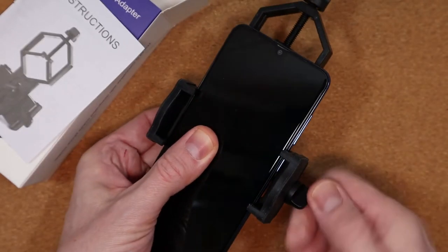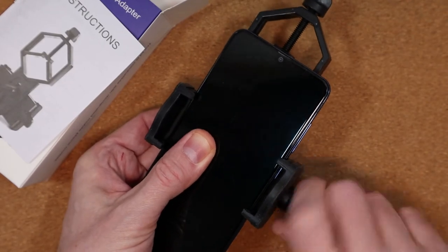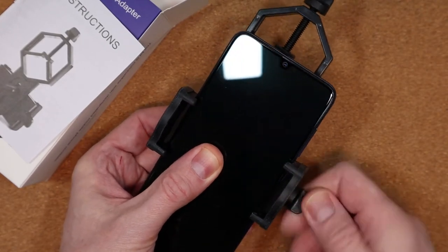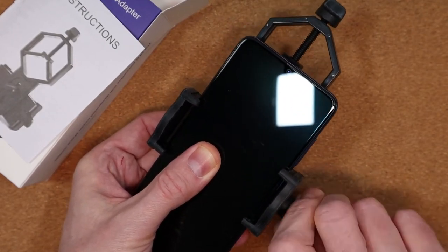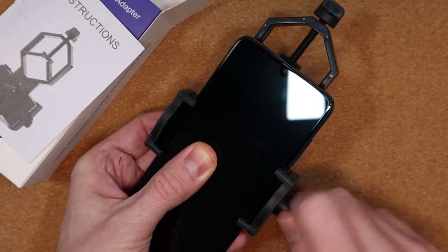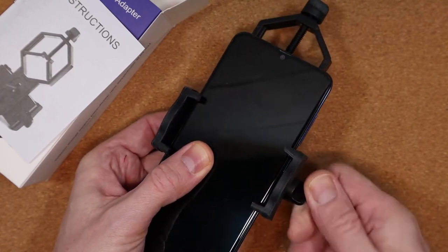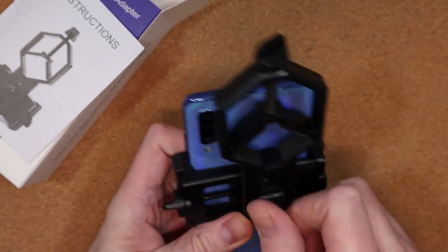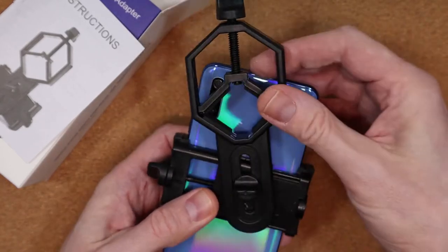Once you've done that and you're happy that your phone is secure, turn the adapter over and slacken off the dial at the back. Adjust the adapter until the lens of your camera is roughly in the middle of the clamp that connects to the eyepiece. I'm aligning the eyepiece of the microscope with the central lens here.